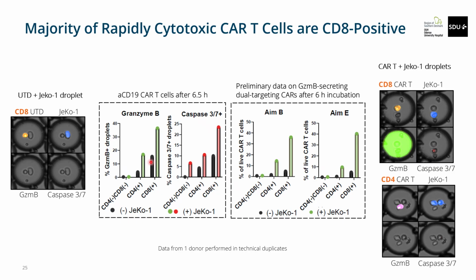What's interesting to see is that there's actually also both granzyme B activity and also a certain level of caspase 3 activity in droplets with CD4 positive cells.